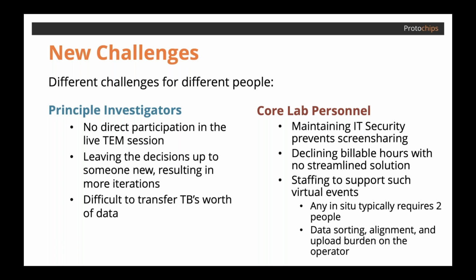And any ad hoc remote experiment is likely going to require more resources remotely than in person with some of these setups, especially in situ, whether it be gas or heating or stress and strain. This usually requires more than one person, one to operate the TEM and one to run and monitor and track the in situ. And with any experiment in the end, there's a ton of data that needs to be sorted and organized and annotated. And with these remote sessions, this now becomes the burden of the operator themselves, so that they're sending a complete package to their customer.